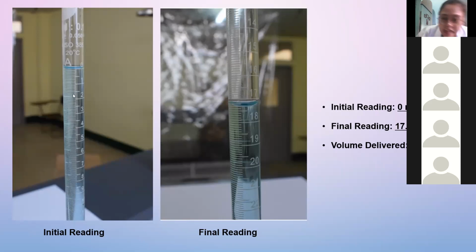0.01. Pero, tanawan ninyo ang lower meniscus kung asa jud siya nag-sit, asa jud siya ni patong sa graduation mark. So actually, tong gihimo nila, I was not the one who made the experiment. Actually, the teacher sa section A ang nag-perform ani na experiment kay wala ko naka-adto sa school ani that time. So ilahang gipapatong jud nila sa 0 ang initial reading. Na that's okay.